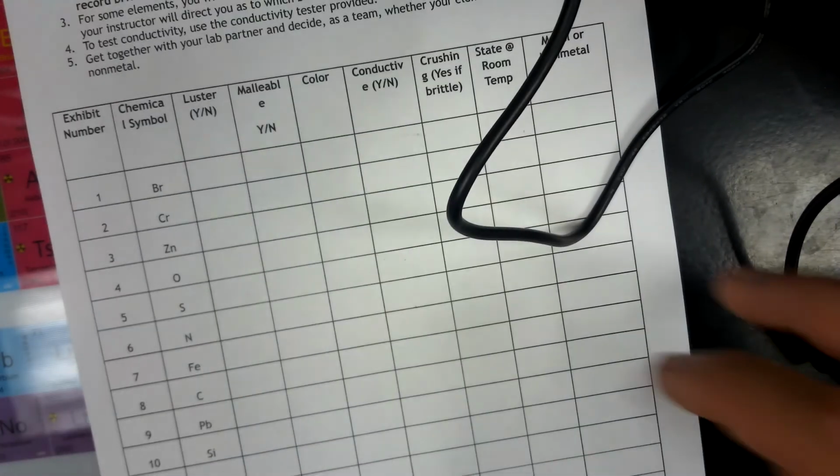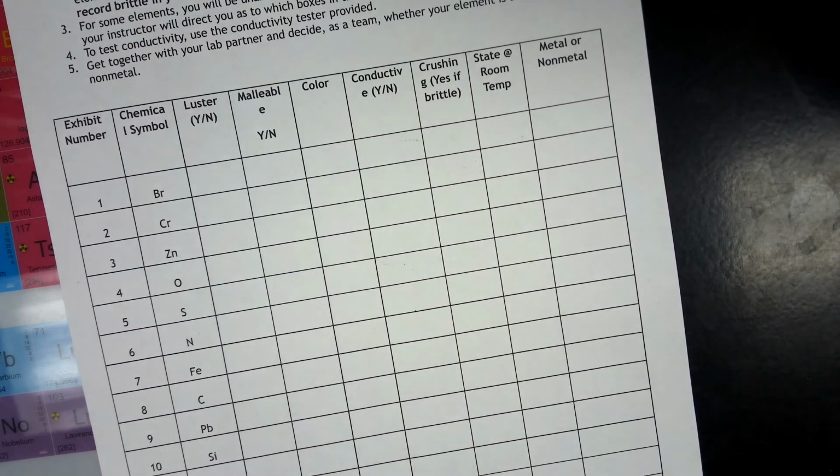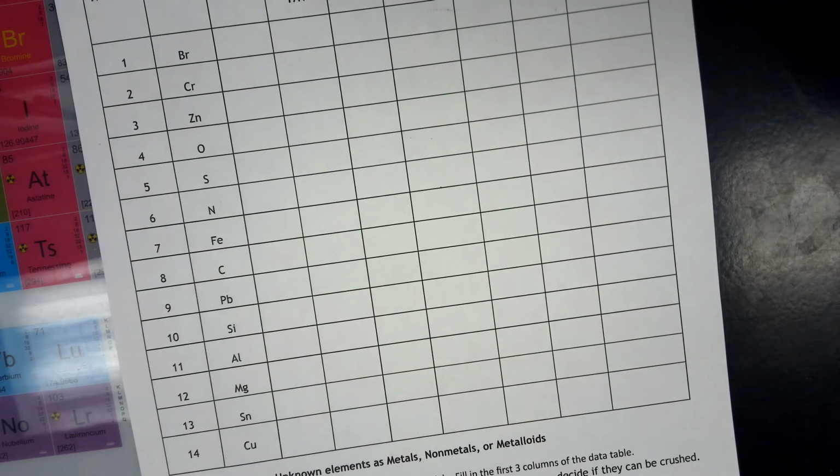Okay, welcome to Physical Science Online Edition. This is our metals lab. We're going to be looking at a bunch of different elements from the periodic table. Clearly the periodic table is mostly metals, so that's why we call it the metals lab, because we are mostly dealing with metals.